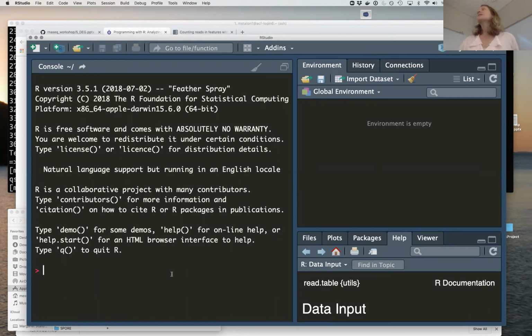So instead of typing ls or cd, you're going to type R commands. So it's kind of like we're switching from French to Spanish. We're switching languages. But it's going to be the same sort of setup where you have a prompt, you type things, you hit enter, the computer gives you some feedback, rinse, repeat.